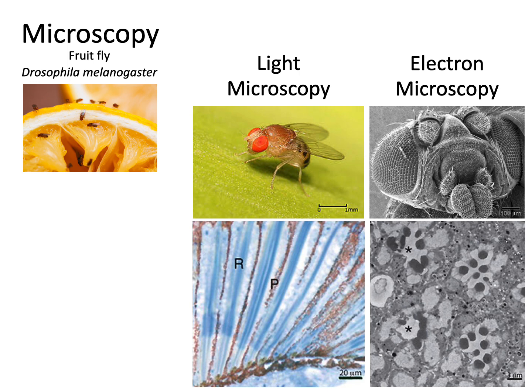We looked at some of the limits to light microscopy and how that's dependent on objectives, and how more important than magnification really is resolution. Magnification, who cares? What you need for data, for information, is resolution. And then on the lower right, those are electrons instead passing through a sample. For sure, the investigators here have thrown on some osmium tetroxide or some sort of toxic, nasty heavy metals that are sticking to tissue structures that are more electron dense or more opaque, and that comes out as lack of signal.